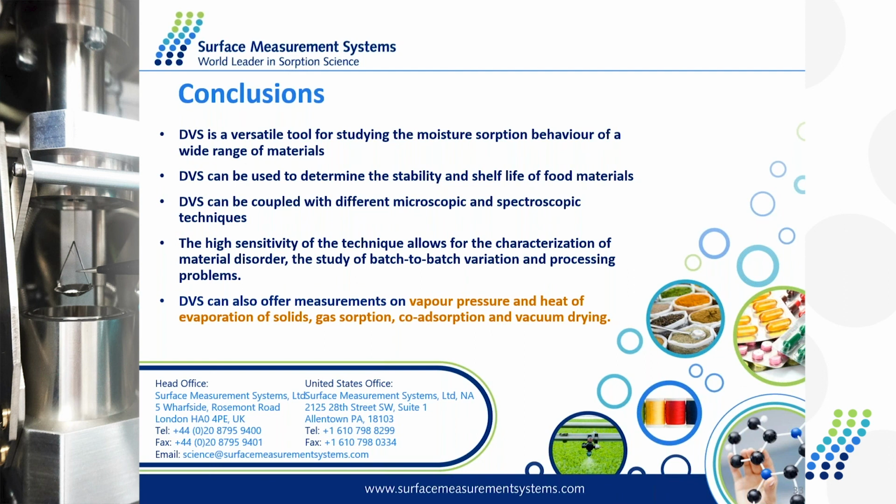Another question is, what's the difference between ramping method and step method? The step method is the one we showed in the red star sample. At each stage of the step method, the sample will reach equilibrium and then jump to the next one. However, for the ramping method, we don't wait until it's equilibrium. It's a much quicker and easier way to study the stability of this kind of solid sample.